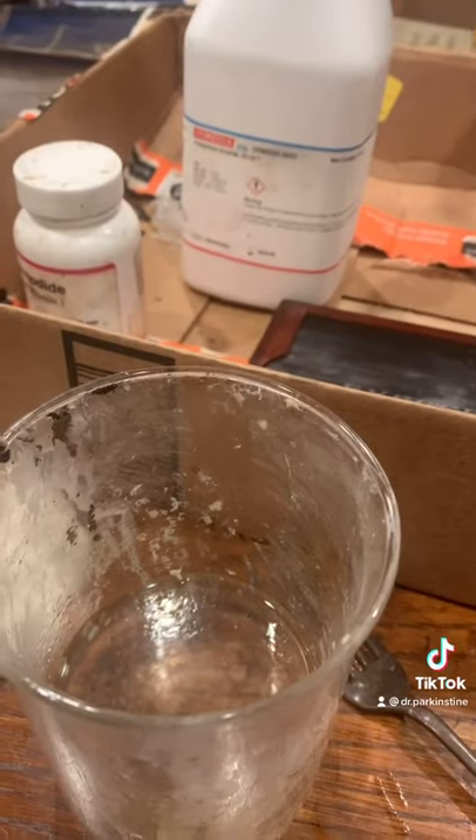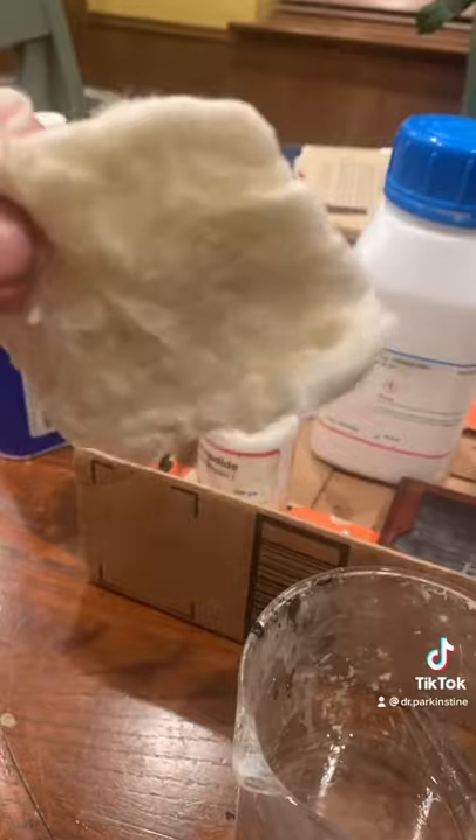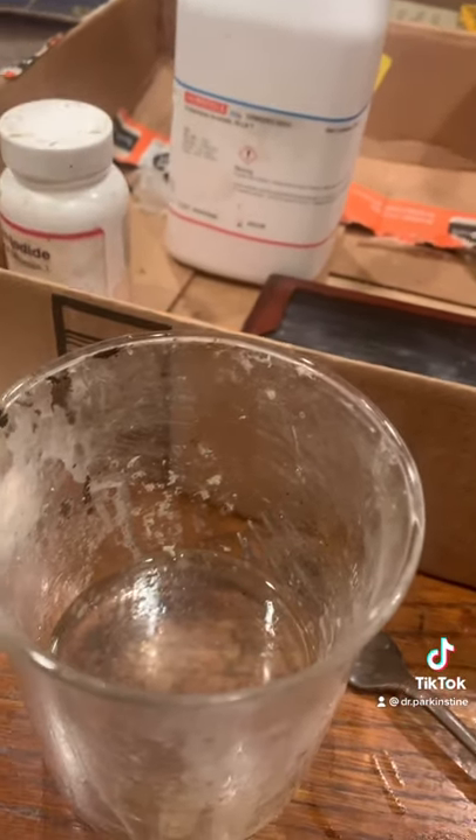I am currently making collodion from scratch for the wet plate photography process. So far I have dissolved 1.5 grams of gun cotton or pyroxilin in 60 milliliters of ether and 60 milliliters of alcohol.